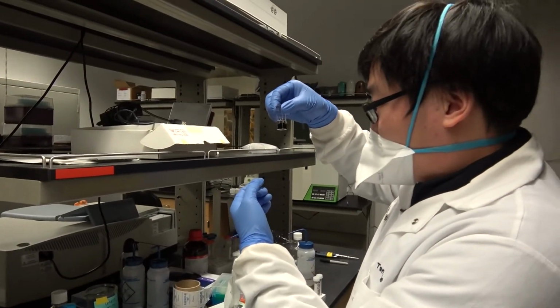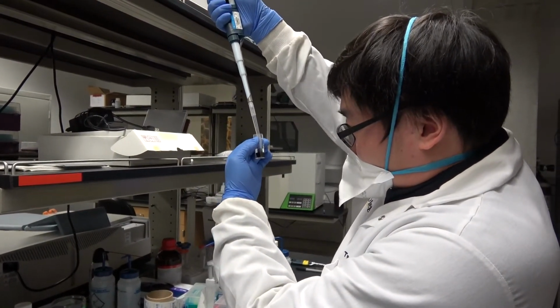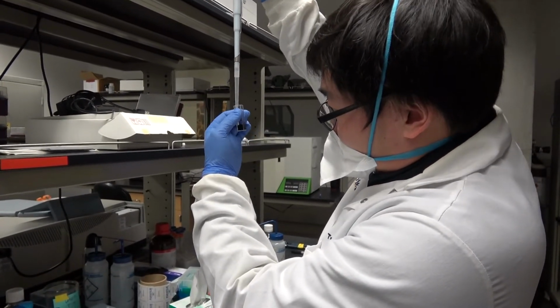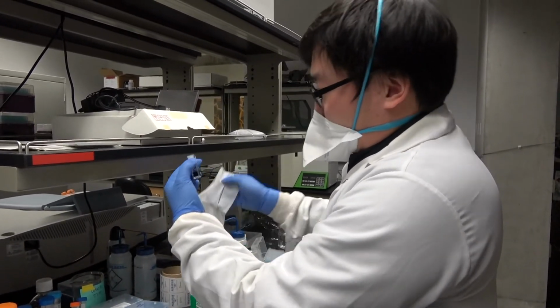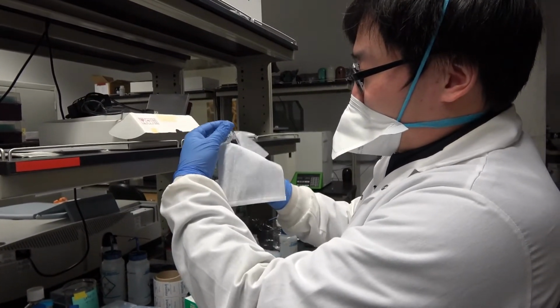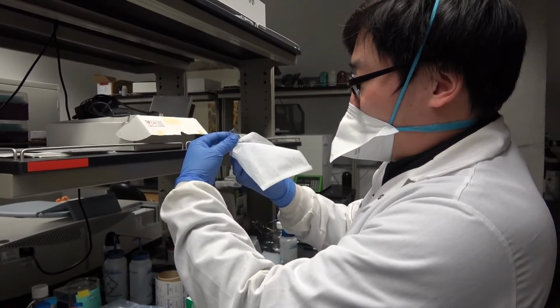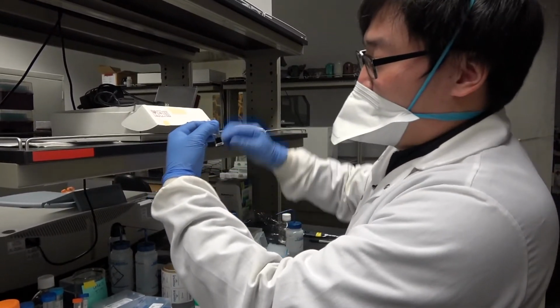Maybe shake it a little bit. Okay, now our bubbles are all gone. And I will make sure the walls are clean, so there will be no light scattering induced by contaminants.